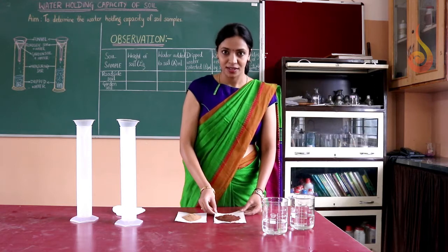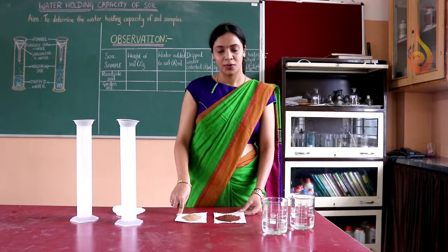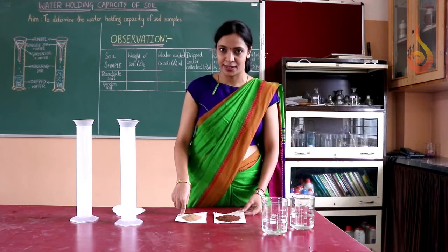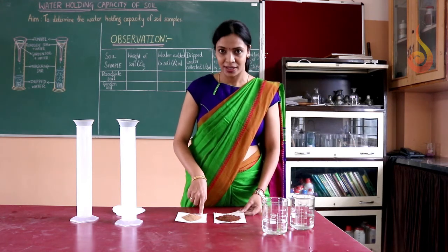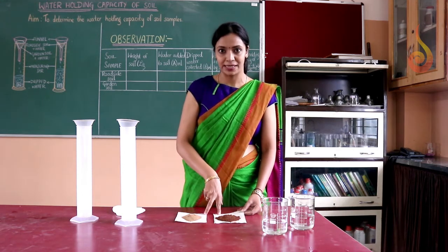After you have dried it, you have to measure equal quantities of both soils. For that you will need a weighing scale. The samples that I have right now are already weighed. So I have 50 grams of each one of these samples.